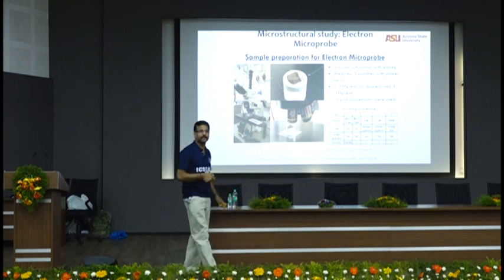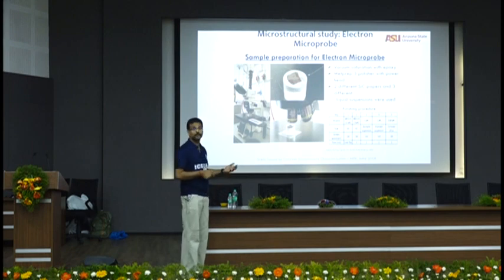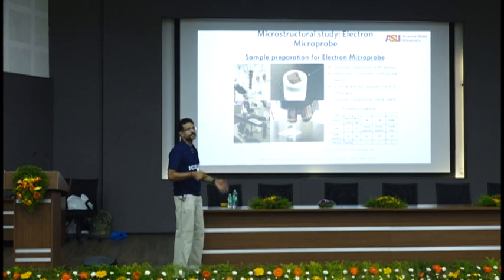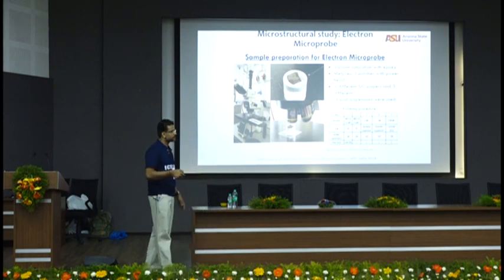You can watch the sample and get your makeup done. It's that smooth and that polished. 0.04 microns is the roughness effectively. So it takes a lot of time. It takes a lot of effort. We have a few systems where you can actually polish 6 of these samples at the same time. But still, it's a good amount of work for a student to get this ready.